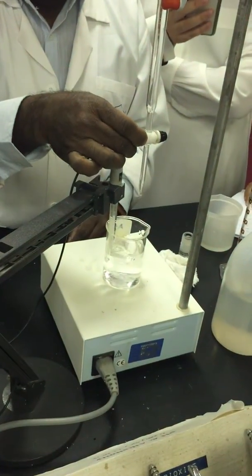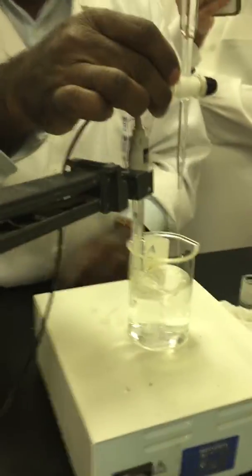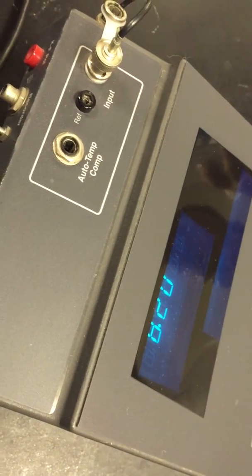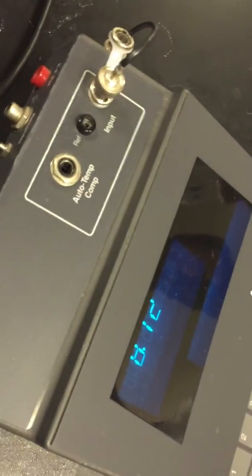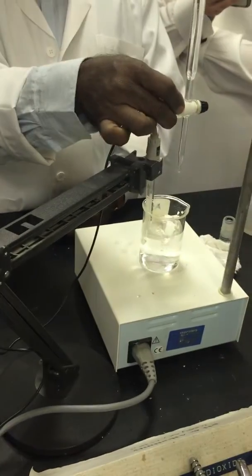After this, add acid here. Slowly add and check what the pH is. The pH should go down. You have to record the pH. Don't try to remember, record it in your sheet. Otherwise, when you're adding acid, you'll forget what the pH was. Record the pH. Then add the acid until the pH goes to 4.5.